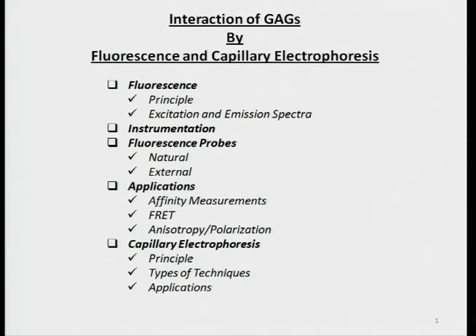We had a protocol that we all did with regard to mass spectrometry, right? The training camps, remember? We did an experiment on mass and we had a little bit of discussion. So we have a small UPLC-MS work that you all will be doing here. And I hope that you all recognize the pattern, the way in which the camp is designed, that there is a consistent pattern, and hopefully that will help you generate a picture.